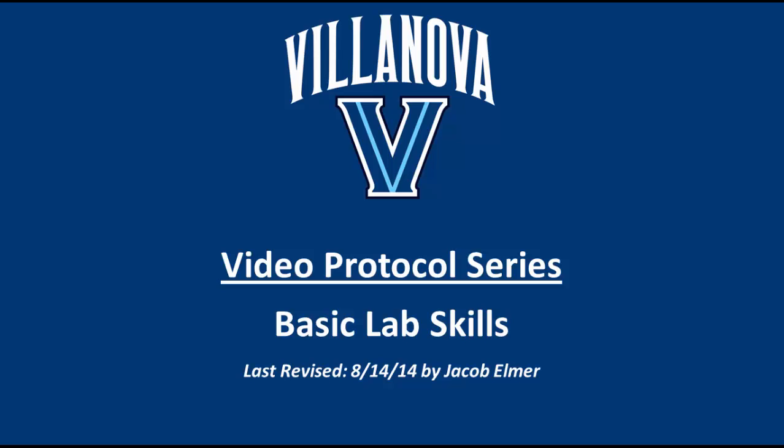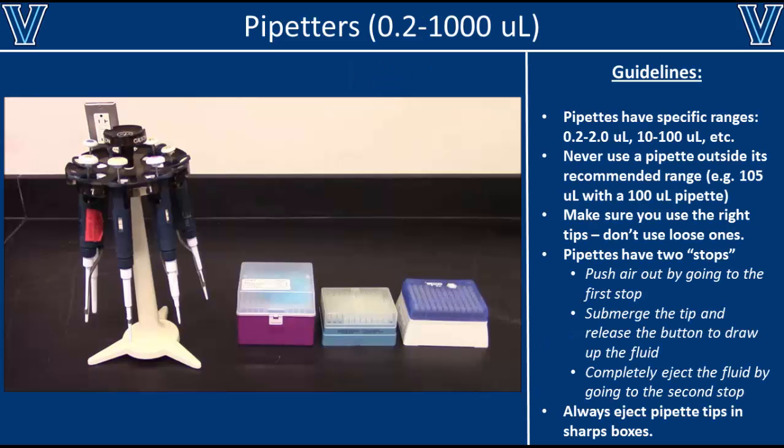Hello. The purpose of this video is to train new students how to use some of the basic equipment that you'll be using in the lab. For example, if you ever need to transfer liquid volumes, you'll probably use a pipetter, also known as a pipette.